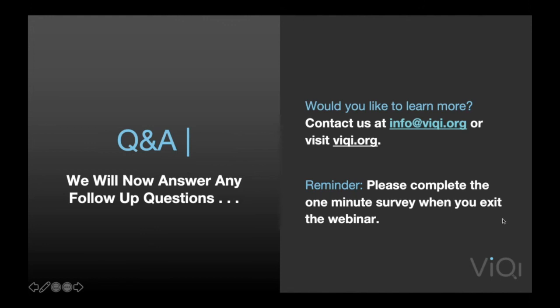But you have tools to tell you whether you have enough data or not. So it's a big range, right? And it really depends on how difficult the imaging problem really is. Great. It's not thousands, right?